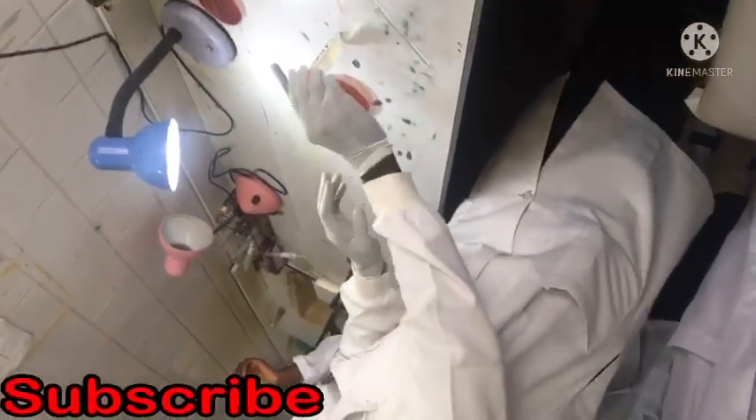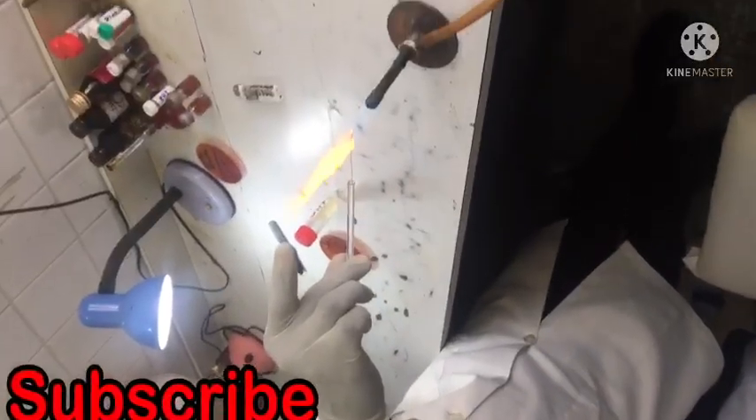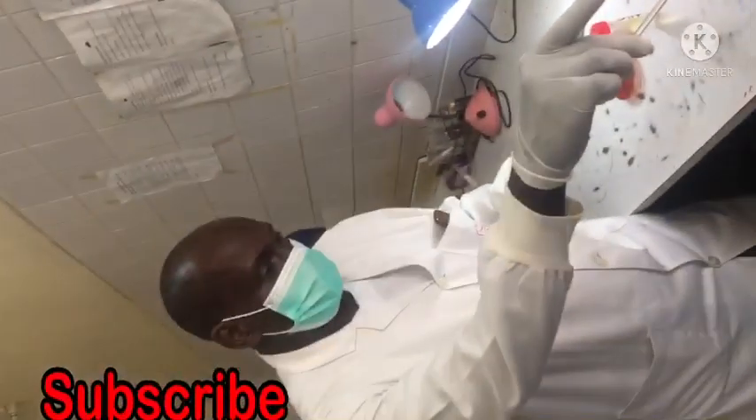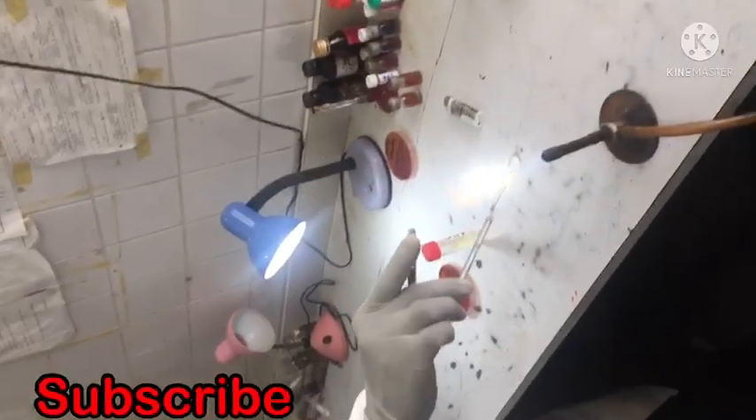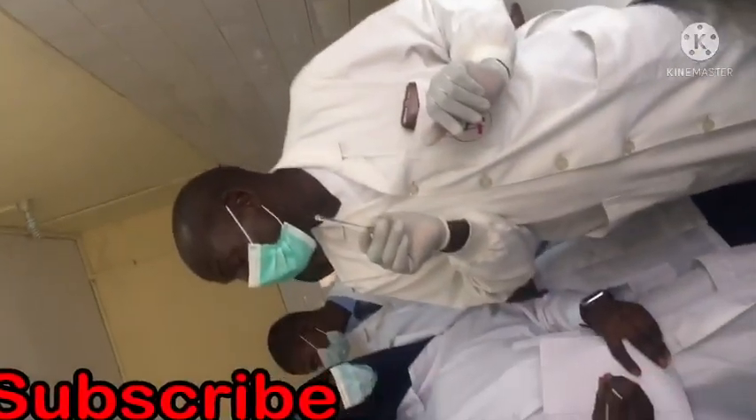First you mix your sample. Sterilize your wire loop — you see it? Until it becomes red. Then you hold it in the air to cool it.